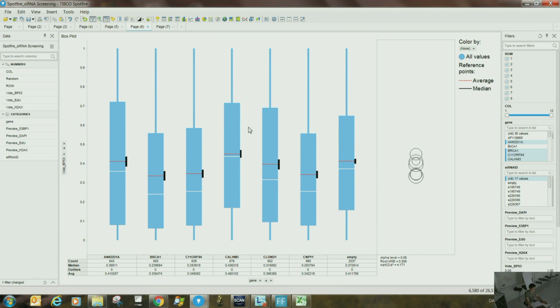Okay. So if you have 3 experiments, that's the same thing. How would you present the data? That's basically a consistency, that's a reproducibility, right? So then you should show the standard error of mean within the replicates. Yeah. But that's basically statistical part. I mean, that we can cover later also. I already covered actually.